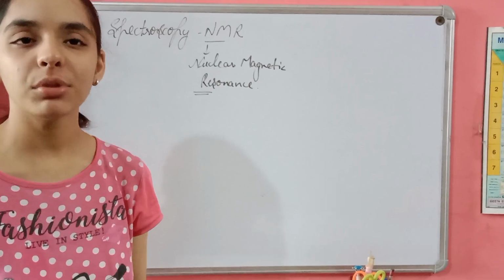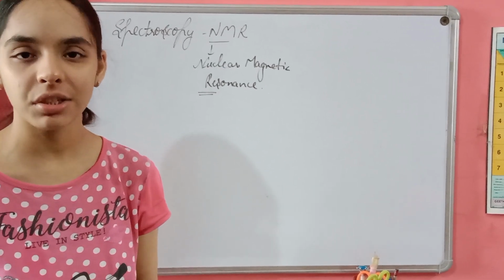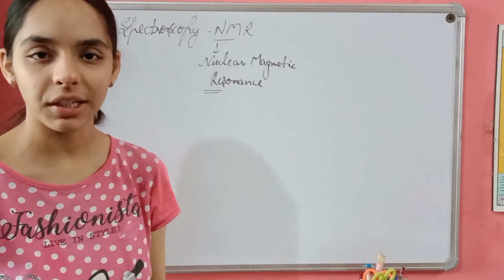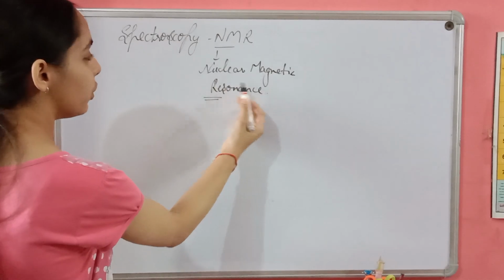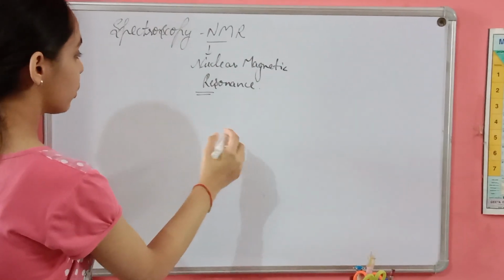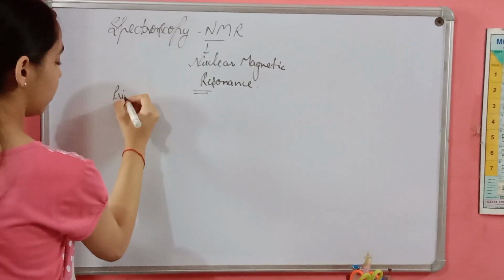My name is Neha. I am a student of BSc Chemistry in the 5th semester and I am here for making a presentation video on the topic spectroscopy and NMR. So let's get started. NMR stands for nuclear magnetic resonance. First of all, we will start with the principle of NMR.